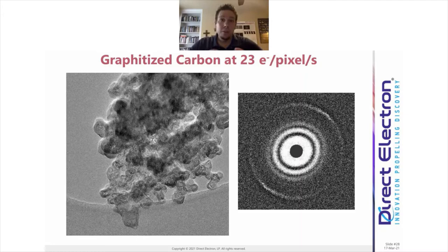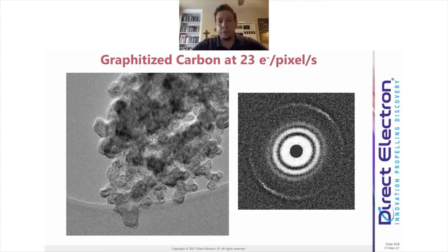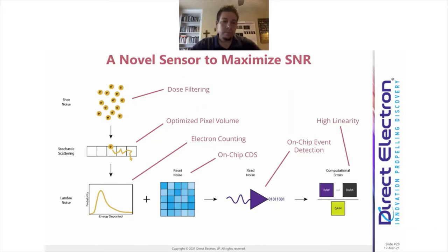The first image we took from the camera was to calibrate magnification using graphitized carbon. With an exposure rate of 23 electrons per pixel per second, I simply turned on the beam, set my brightness so it covered the sensor, and took an image. After motion correction, you can see information up to physical Nyquist. The graphite ring is close to Nyquist frequency and quite strong, indicating we can use a relatively bright beam without a dark spot in the middle from coincidence loss.